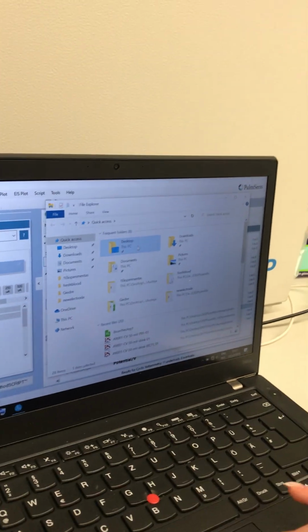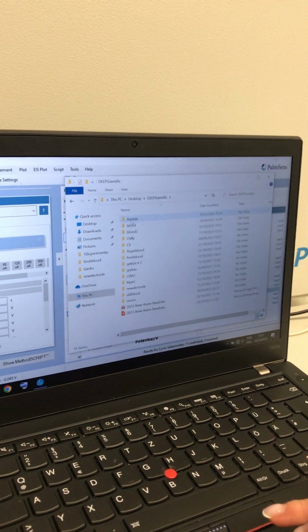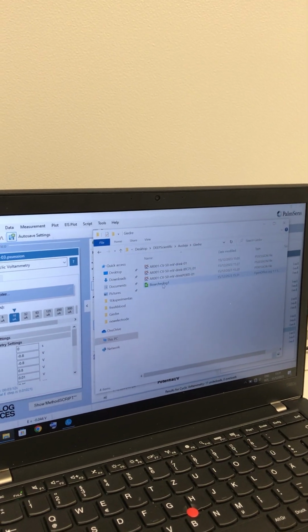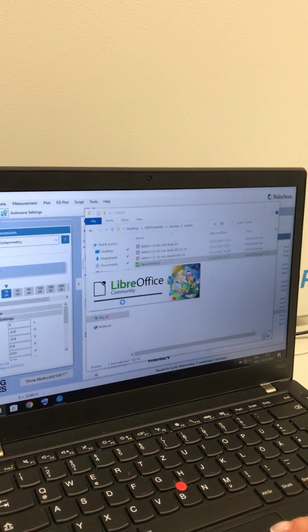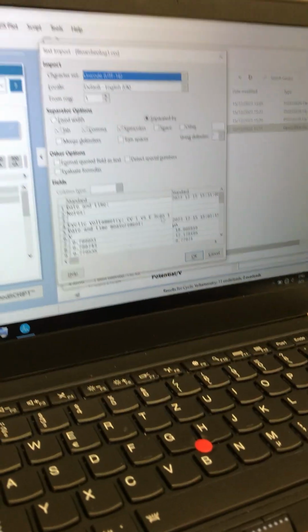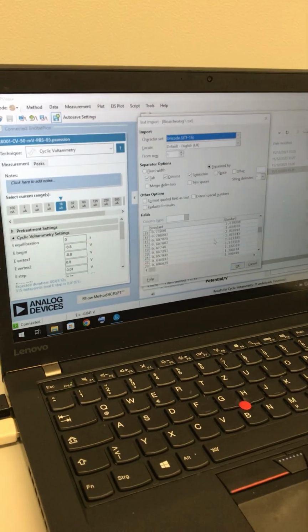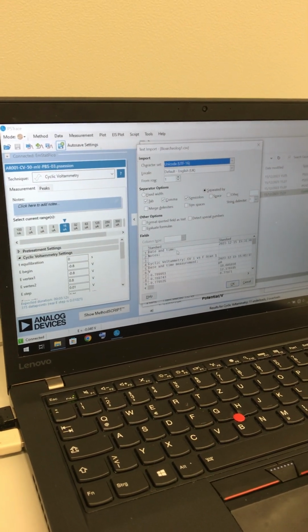And you exported all three now, right? The overlaid version, which is great. It should be there. Usually I name by the electrode and the people that are there. Oh, so you're using OpenOffice? I think it will open in Libre. It might be my computer, but usually you might use Excel. What you get here is a text file, semicolon separated, and there's one column for voltage and current.